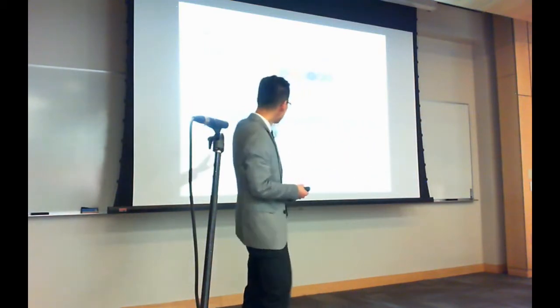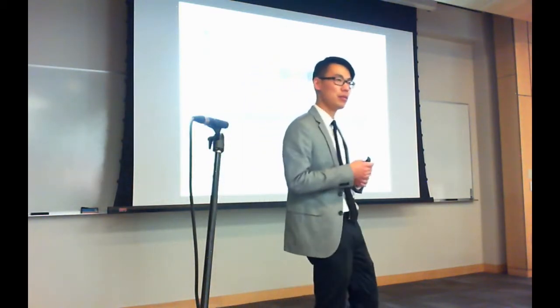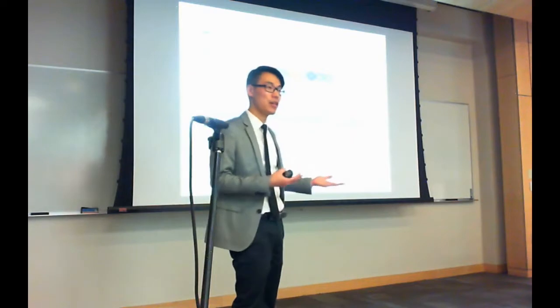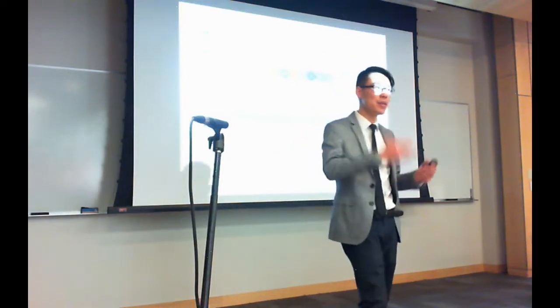And the National Institute of Standards and Technology, NIST for short, they provide a peptide spectral library. And this is what a lot of the community currently uses. Unfortunately, it lacks coverage. It covers about 26% of the full proteome. So it misses a lot of the amino acids in the proteome.